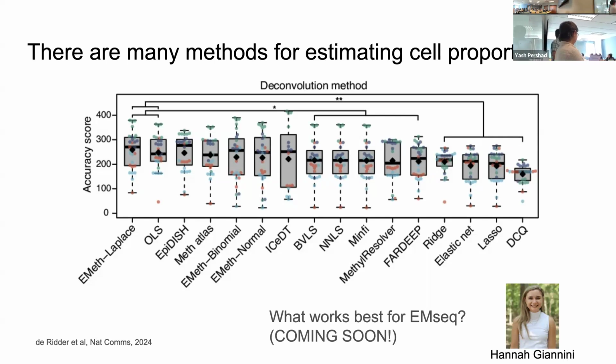And I think it's a great question. You might expect different performance with enzymatic sequencing to ascertain methylation compared to EPIC arrays. That's not been fully benchmarked yet, but Hannah's working on it. So for now, we kind of have to live with what we have.